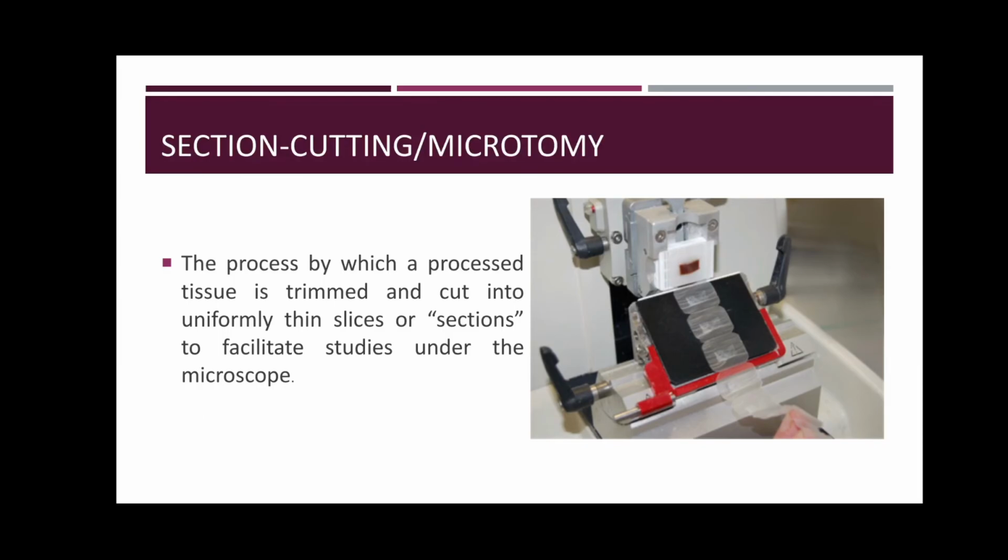Remember that in your risk management lecture, microtomy or section cutting is the most common accident that can happen in the histopath laboratory. So a medical technologist must be very, very, very careful in handling the paraffin-embedded tissues while around the microtome.